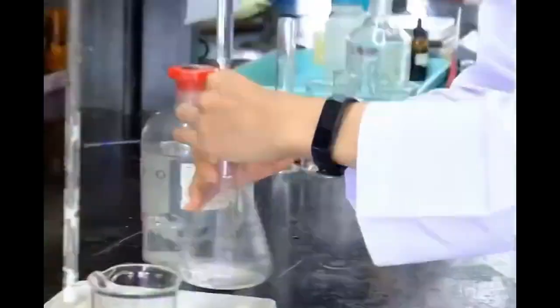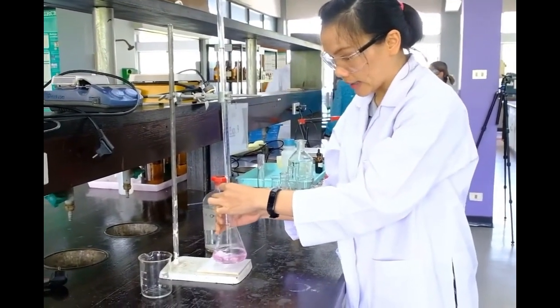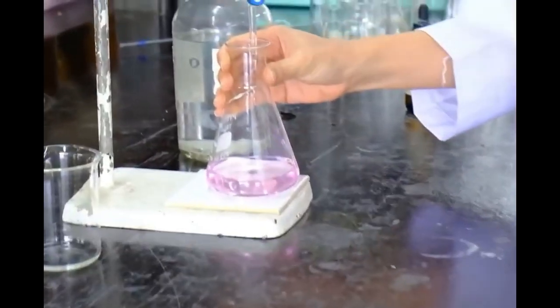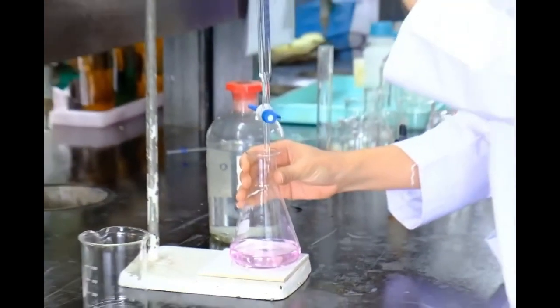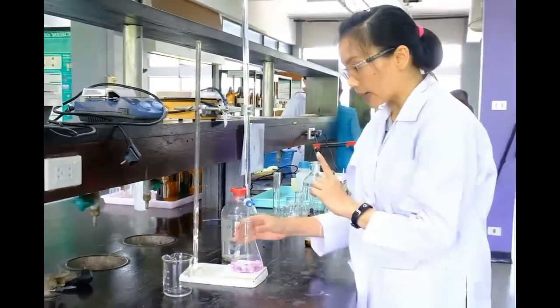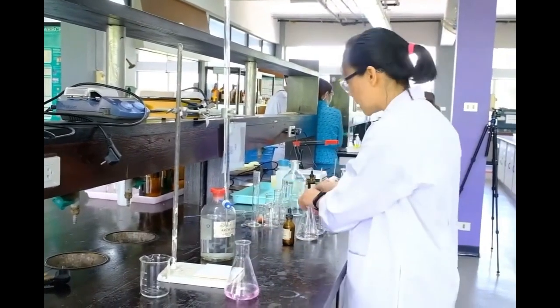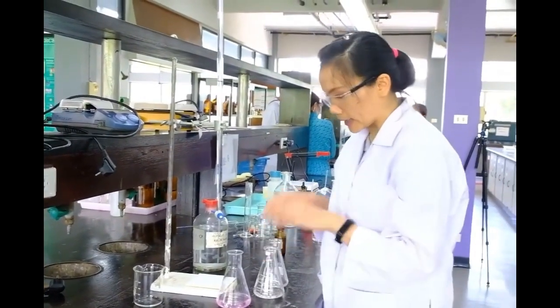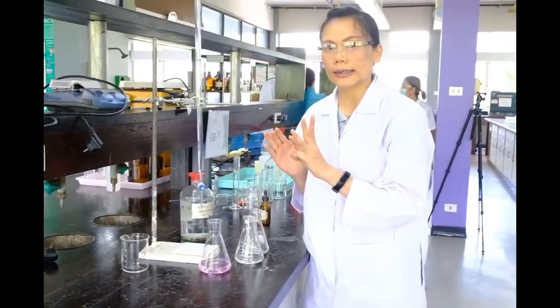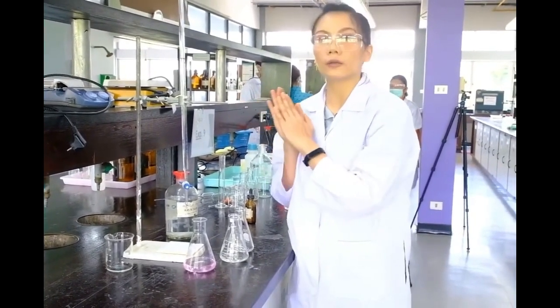When the endpoint is reached, which is a pale pink solution, record the volume at the endpoint. Then, repeat the titration 2 more times. Therefore, you will have a total of 3 endpoint volumes. After that, find the average and calculate the concentration of sodium hydroxide.